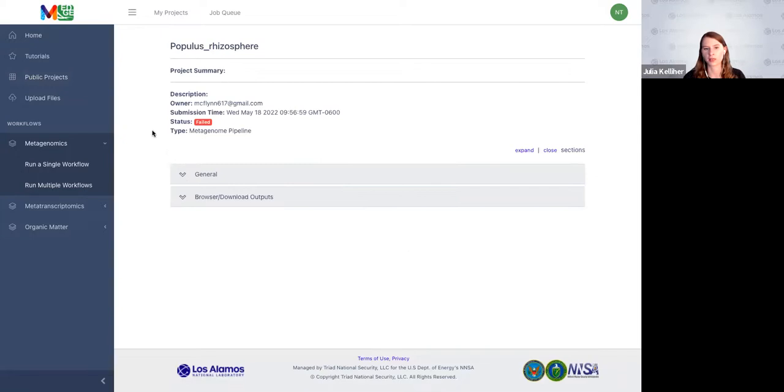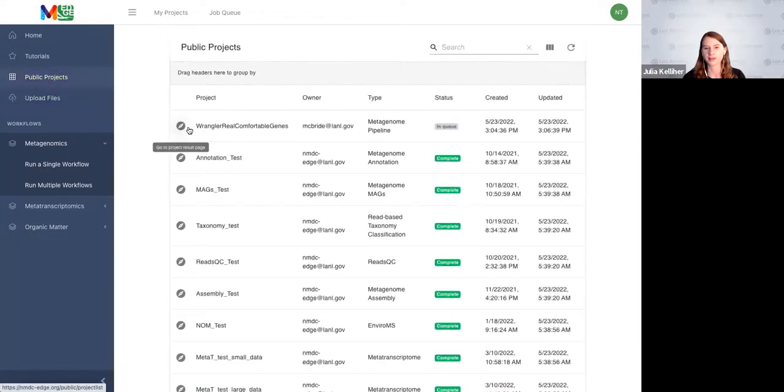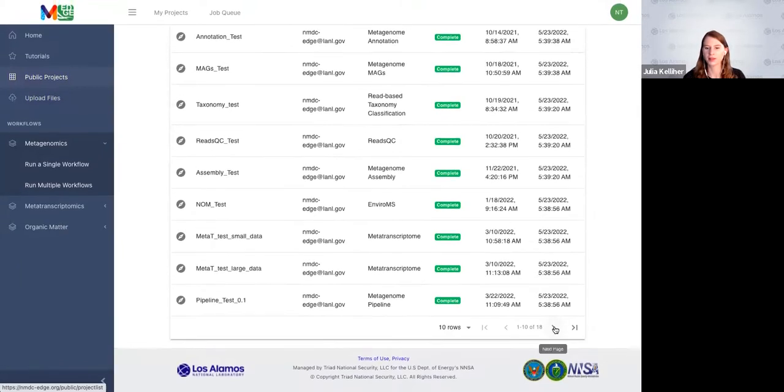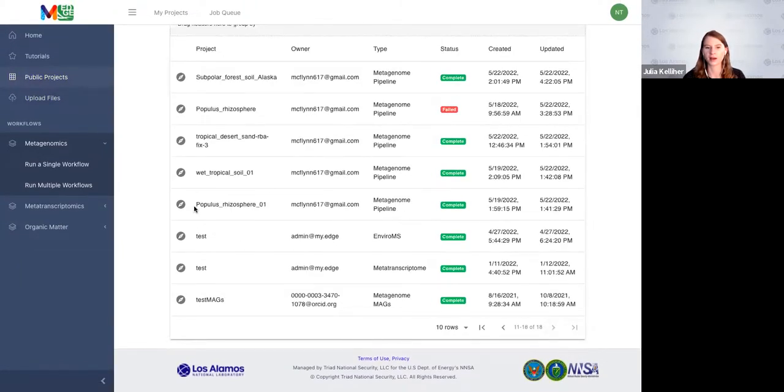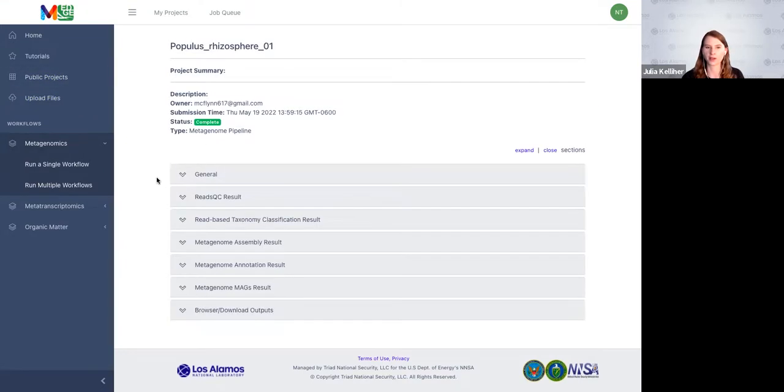You can see the results from these as if it were your own output. I'll walk through this one specifically, but anyone can feel free to walk through the results on their own for the public project for the input data that you chose for your own runs.